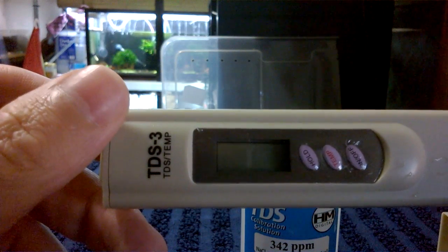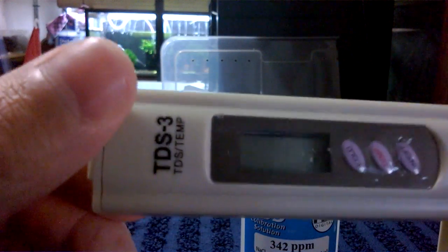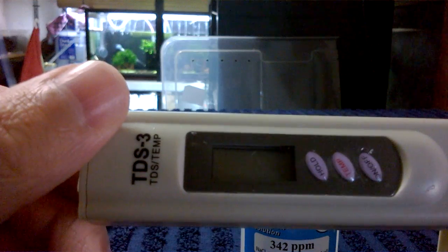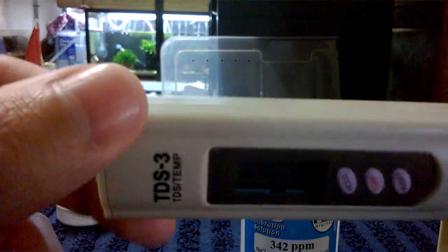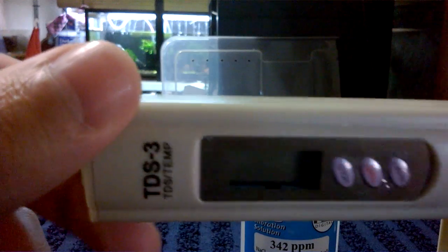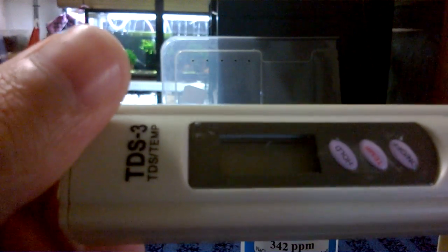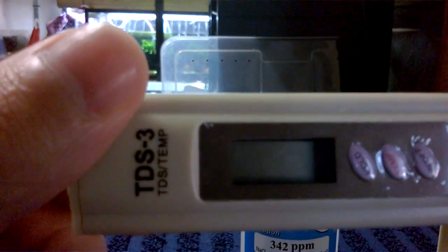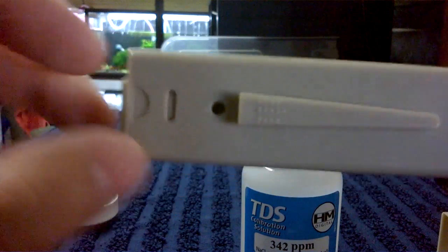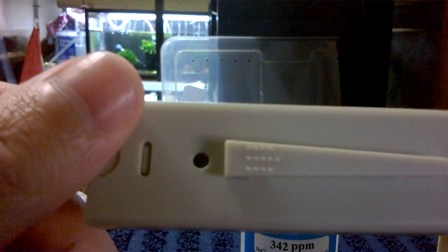The seller has actually sold 1,400 of these units, and if they're all like this and faulty, that's 1,400 people who have been ripped off. When I asked the seller about it, he told me it was self-calibrating — which is basically a lie. If it's self-calibrating, why does it say to calibrate with calibration fluid on the ones that work? He didn't have an answer. On eBay, if someone sends you an item not as described, you don't have to pay return shipping.